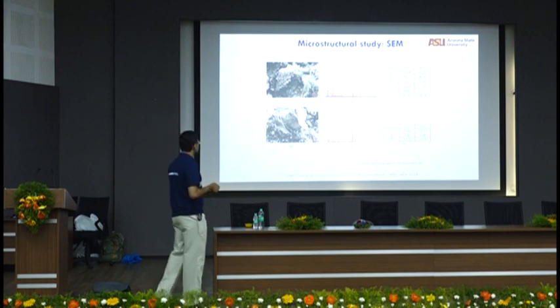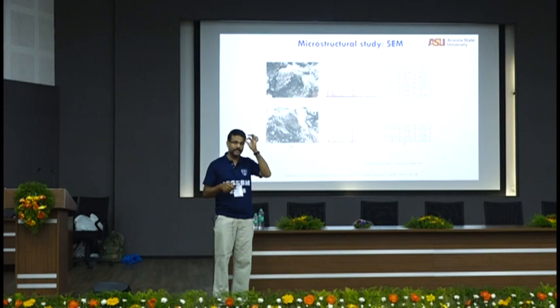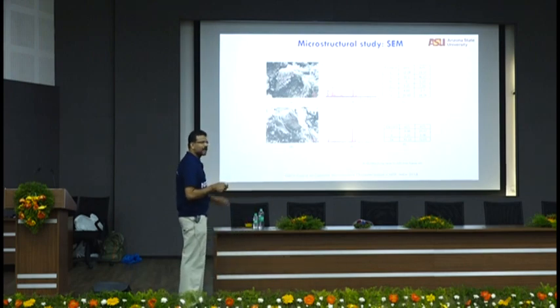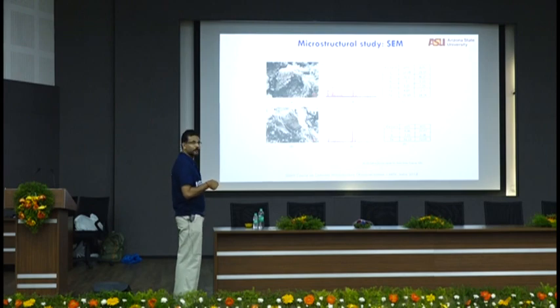This is a system with powdered iron in it. So we were trying to create a more ductile composite. So it has some powdered iron, angular powdered particles of iron. So here is an area EDX. It's not a spot, it's an area EDX. So you define an area and you get the area EDX, and you see what you have. You have some iron, you have alumina, silica, calcium, iron, and then you can get weight percent and atom percent of what you have from EDX at that location.